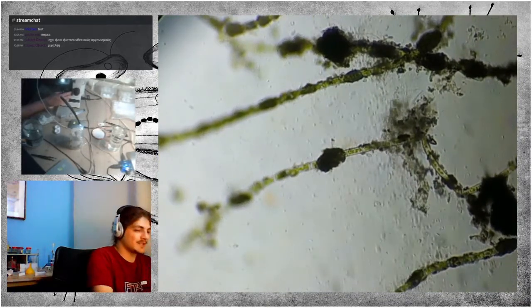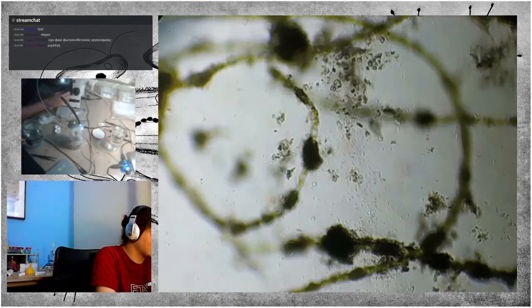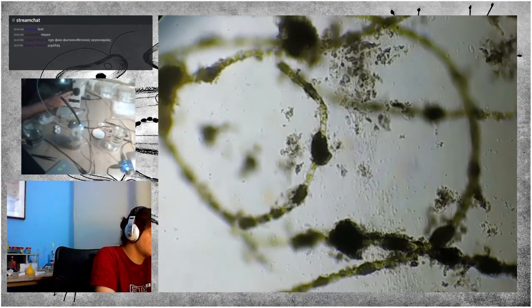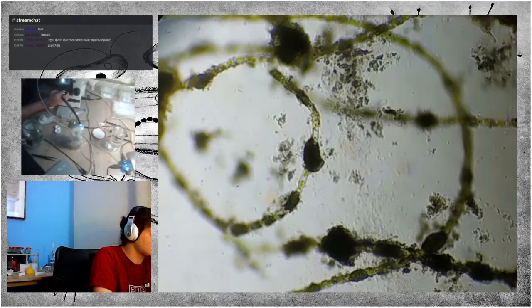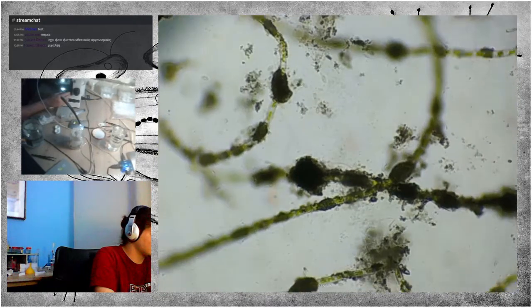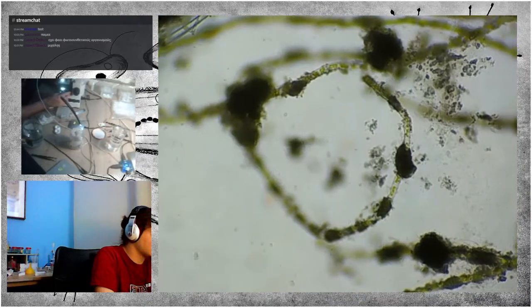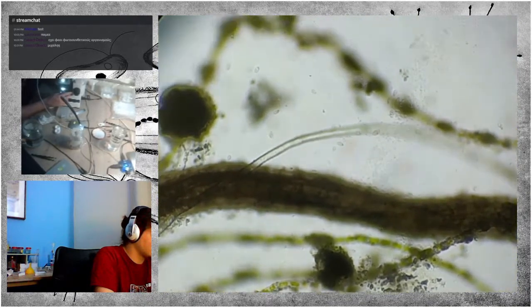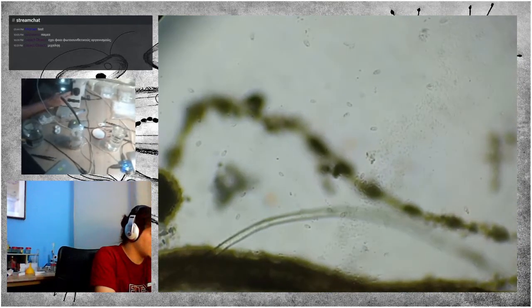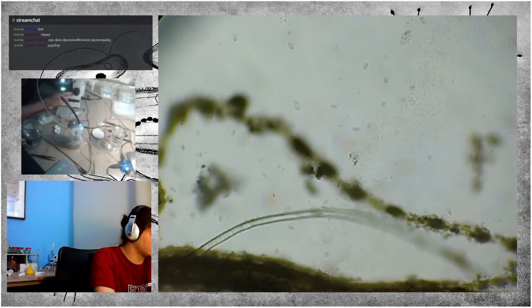Yeah, the word that I was looking for is chloroplasts. The chloroplasts contain chlorophyll, which is the green pigment, and it is basically the base of photosynthesis. It is the molecule that does the photosynthesis and creates sugars from essentially carbon dioxide, CO2, and light and water.